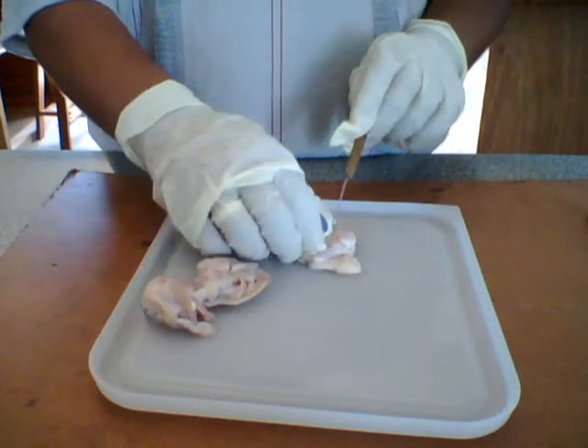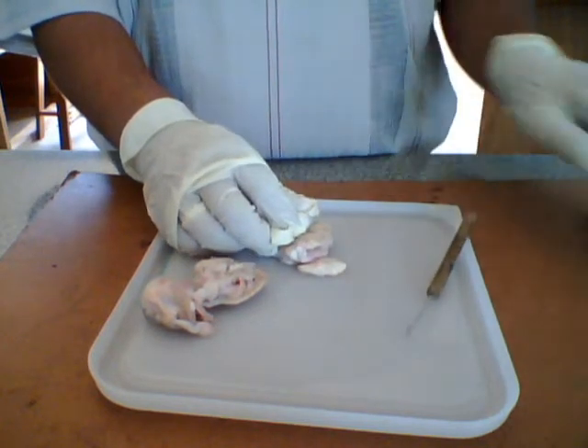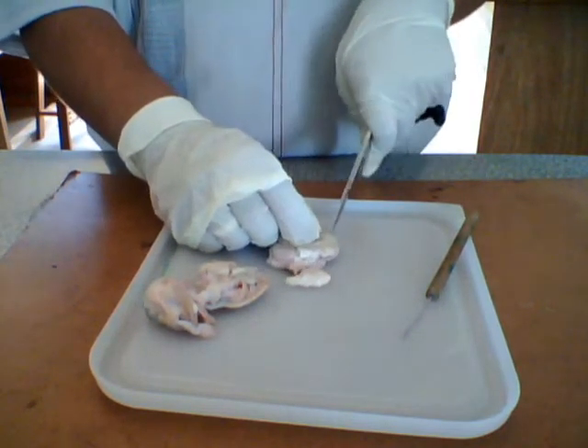Now this is the frontal view of the eye. We're not going to be using this piece of the eye, so what we need to do is remove it. We do not have a scalpel, so we're going to work with what we have.